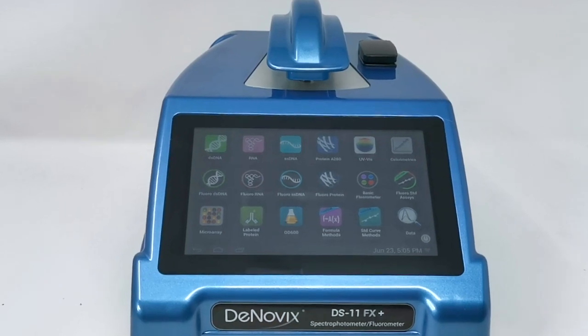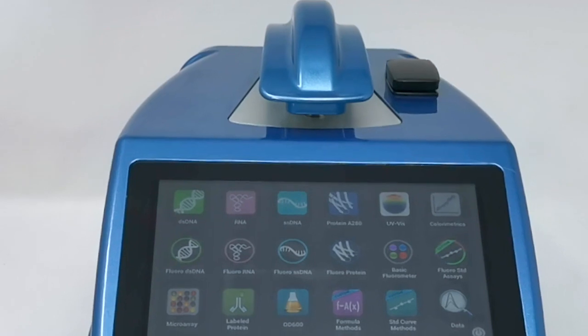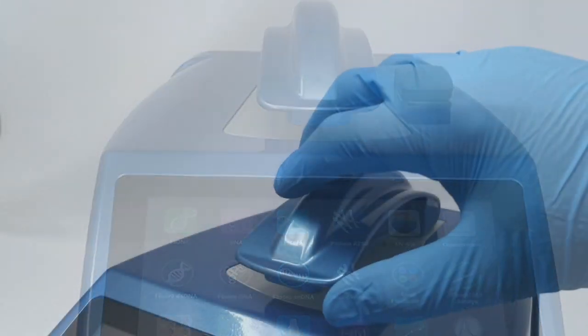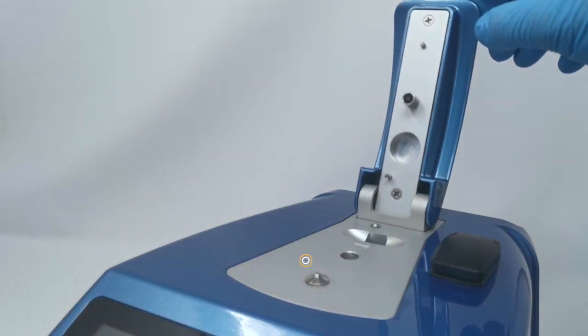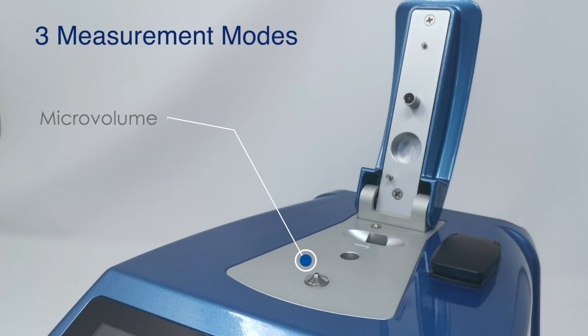A range of models is also available that allow researchers to choose from any configuration of modes to suit their laboratory's current and future needs. First we have micro volume absorbance — this is full spectrum UV-vis in one microlitre samples, with one microlitre pipetted directly onto the front pedestal.